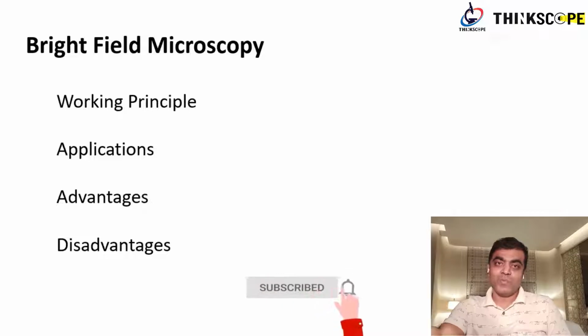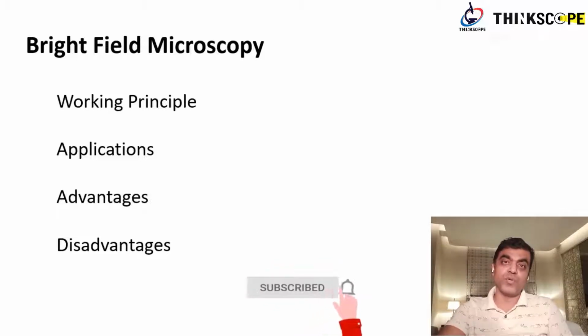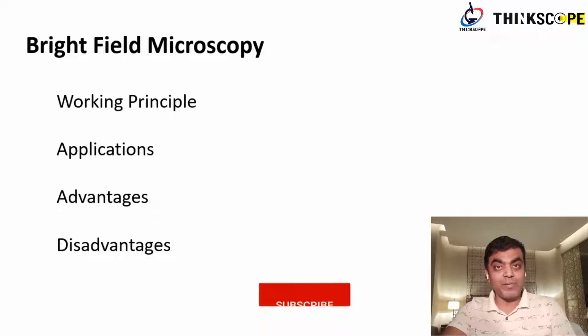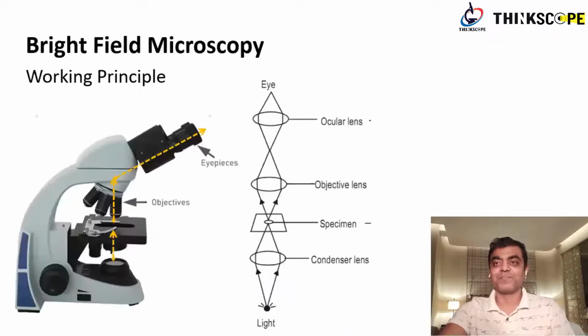Today we'll be talking about Brightfield microscopy. So let's brighten up the way. We will be talking about the working principle, the samples which will be useful for Brightfield microscopy, various advantages of Brightfield microscopy, and also the disadvantages associated with this technique. Okay, so let's start.